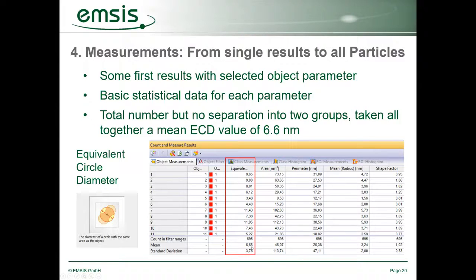And below I see also some basic statistical values. They are counted, and I get also a mean value. The mean value here is without any use for me, because my goal would be to do a double labeling analysis, and so far this would not be possible.